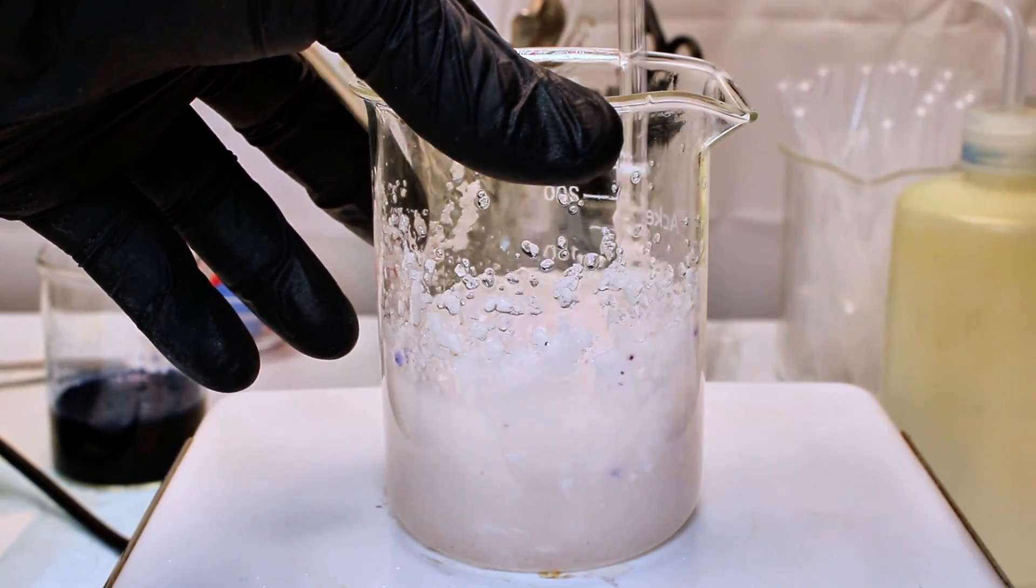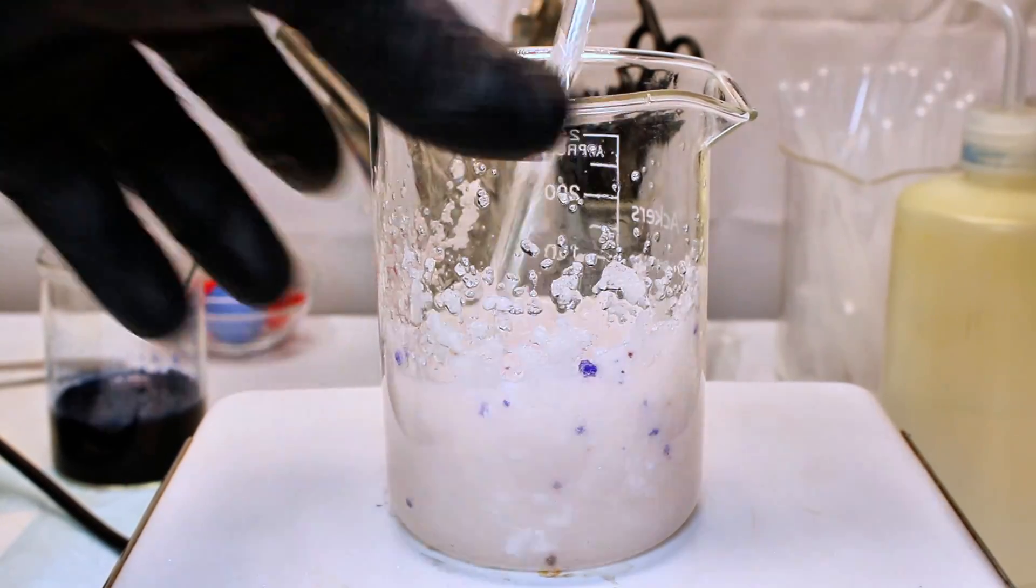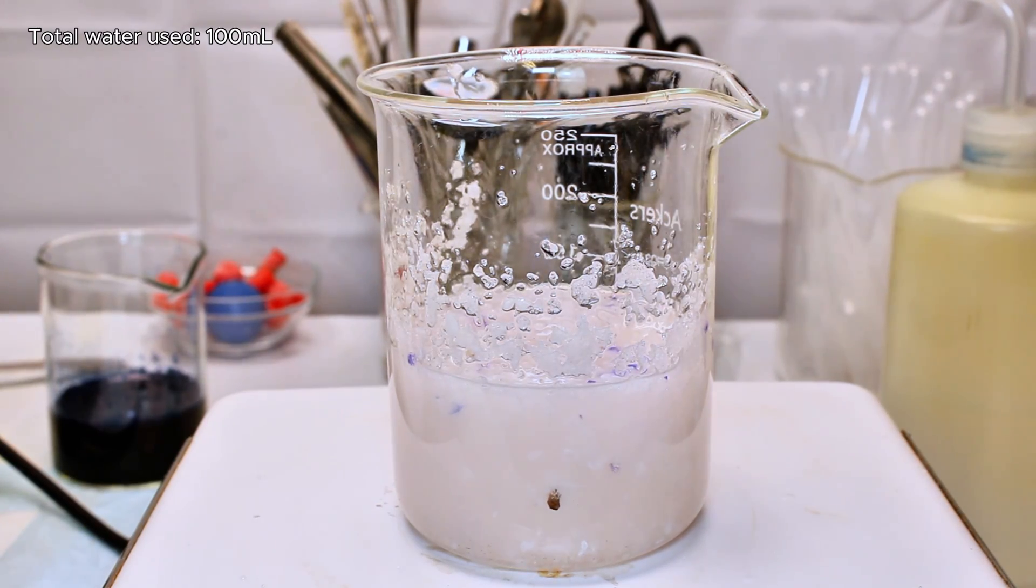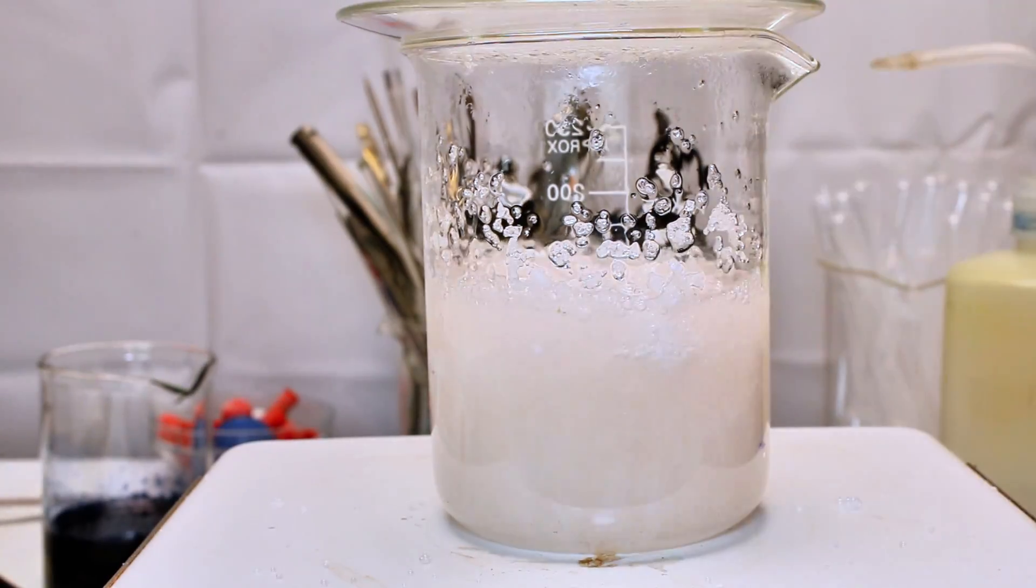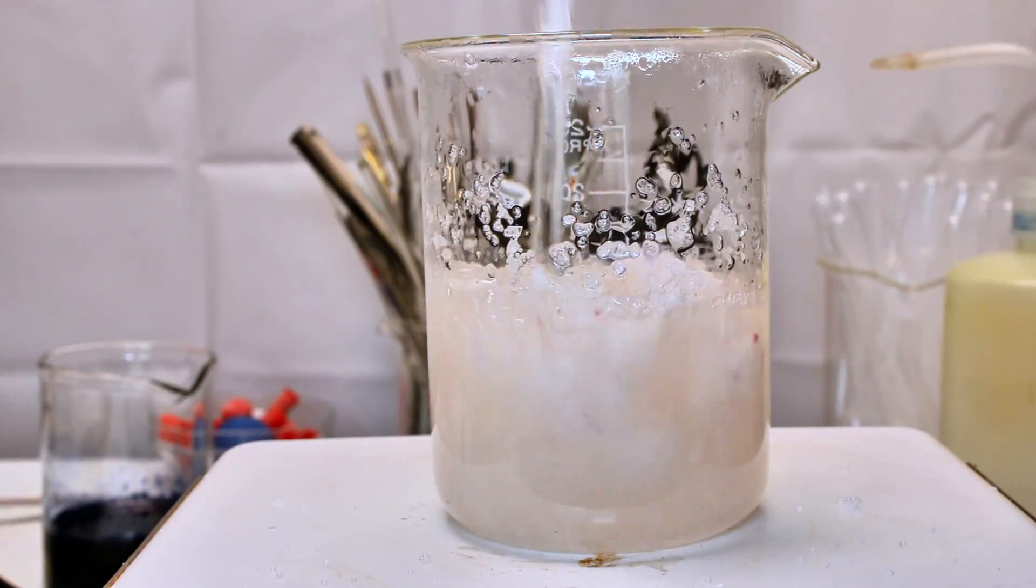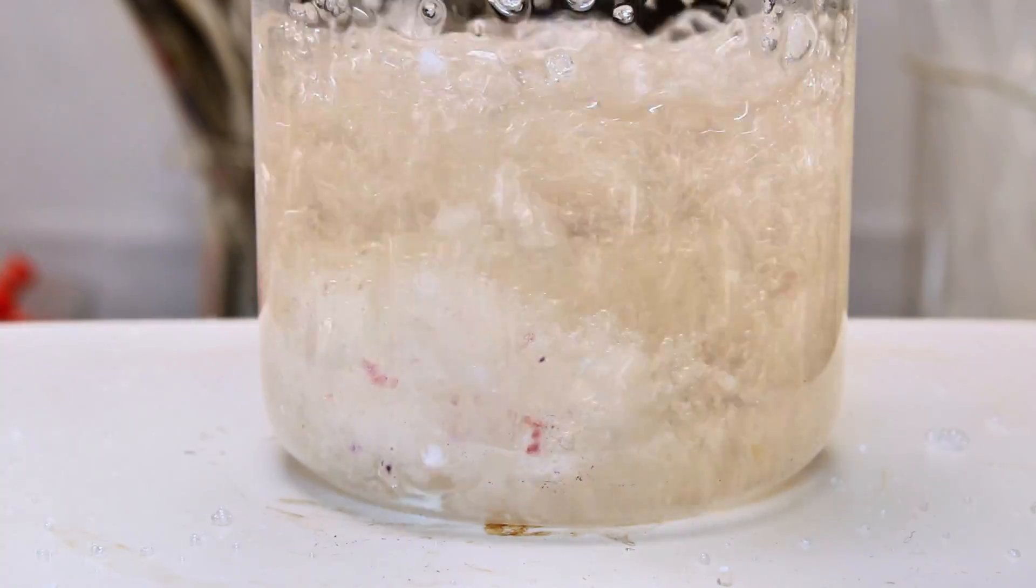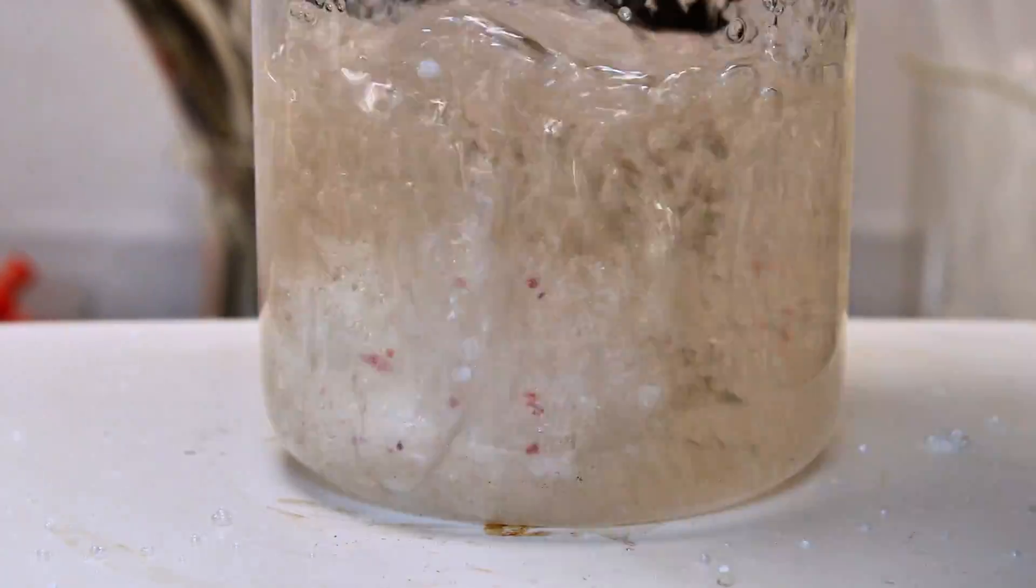Anyway, once it calmed down a bit, I added a bit more water until I had added a total of 100 milliliters. I then boiled the mixture, giving it the occasional stir until all the kitty litter was completely dissolved. At this point, I had a concentrated solution of sodium silicate, which is an extremely versatile chemical more commonly called water glass.